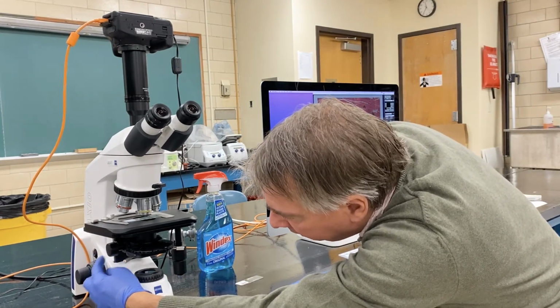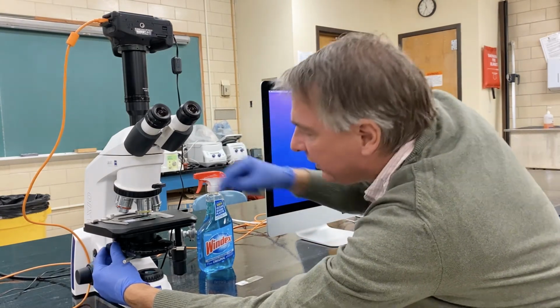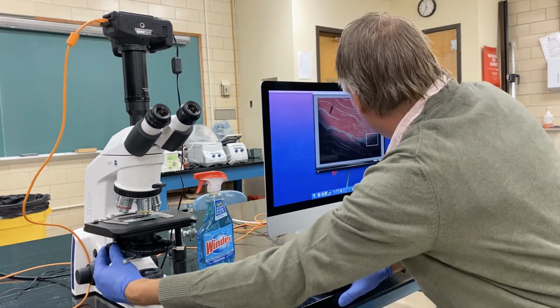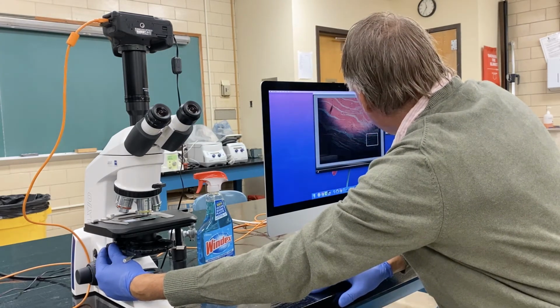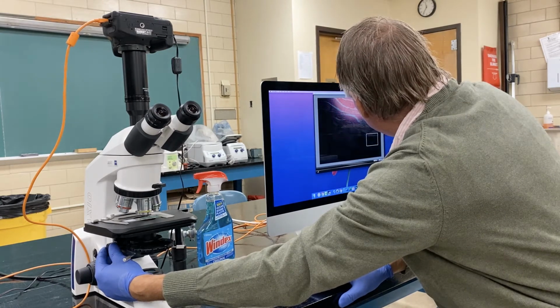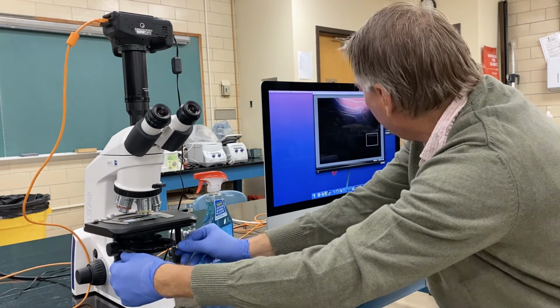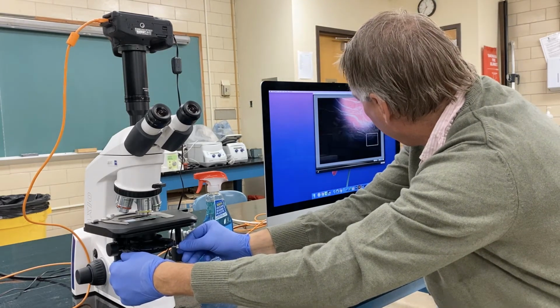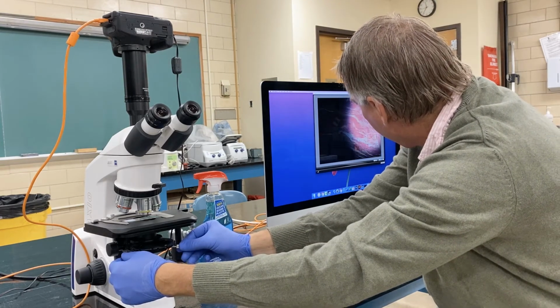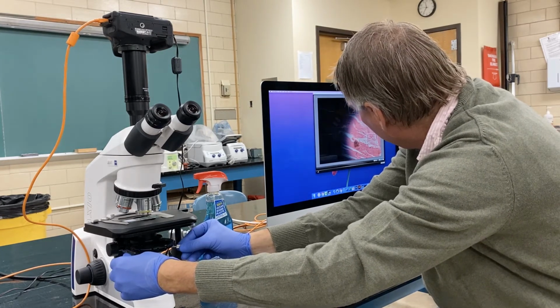Now I'm going to try to focus the condenser lens by turning this knob here, which is in front of and above the focus knob for the sample. So this is to focus the condenser lens that's below the sample. So I'm bringing it up and it's condensing the light. And now I'm going to readjust the condenser lens so it's a little bit more centered.